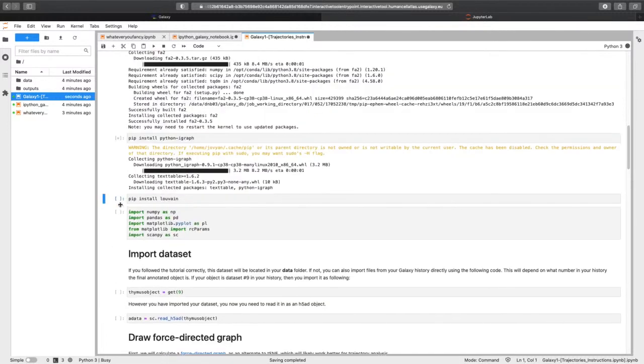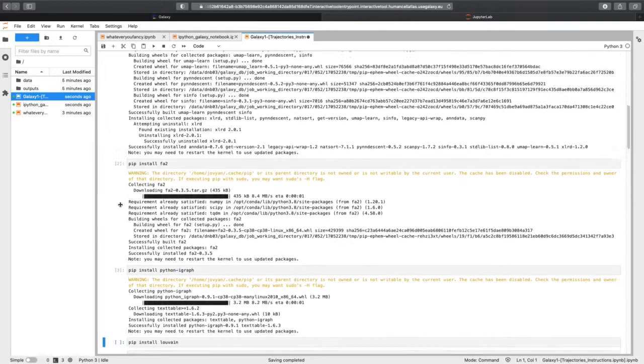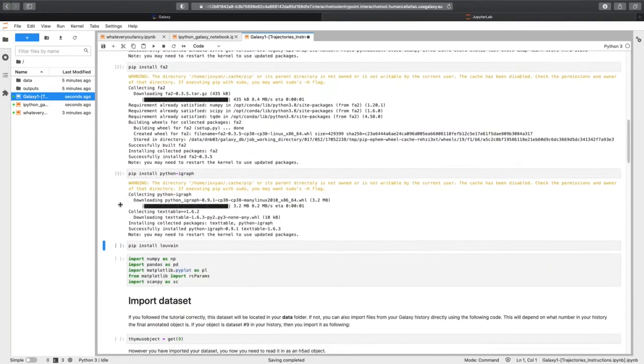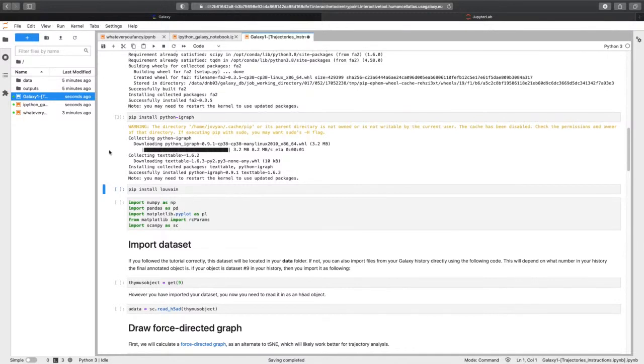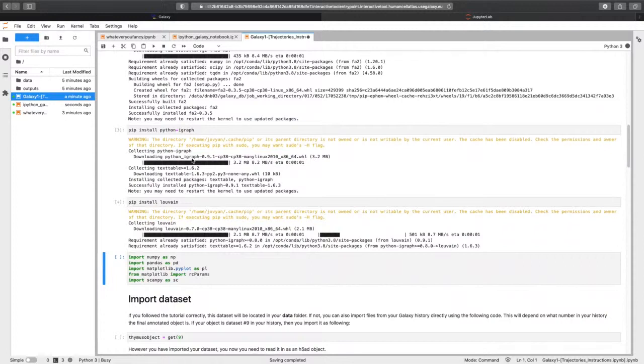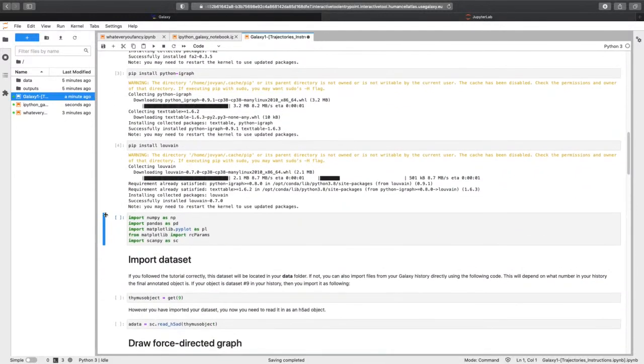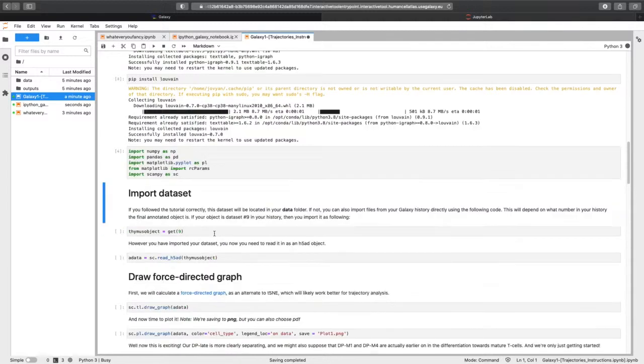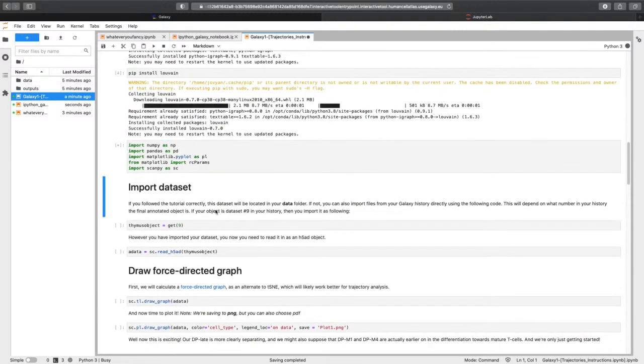Onward we go. And I'm not running these all at once. That might be my own superstition. Or someone's a bit smarter on the backend side of Python could tell you more about this. But I find if I run them all at once and try and install them all at once, sometimes it doesn't remember to do everything after the first one. So I've just gotten in the habit of doing it one by one.